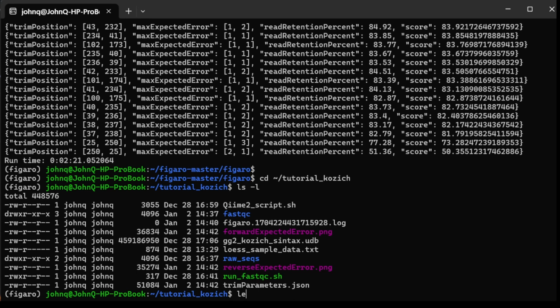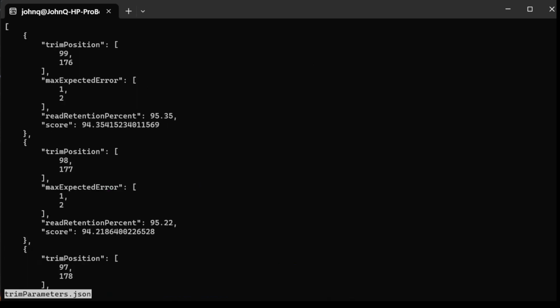If we look at that, it presents the same information we saw at the top of that section of the screen. So you don't have to worry about losing these values if you close your terminal or something. They're still here. So you can go back and get them there.